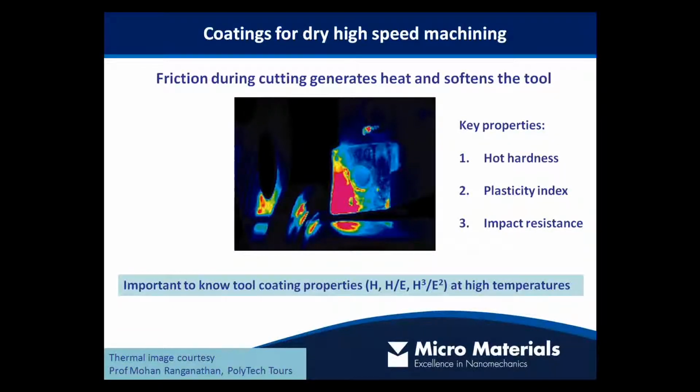Thinking about what goes on top of those cutting tools, mostly the coatings, coatings designers have quite a difficult job to manage. They want to optimize their coatings for predominantly high hardness in high-speed cutting operations.